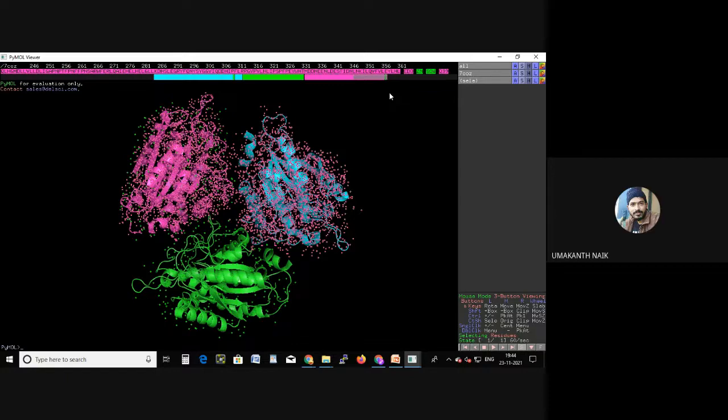If 2 chains are having something different, then we will generate 2 grids, and 2 active site residues and 2 binding site residues will be generated. But here they are similar, that's why we are removing them. And I'm also removing this.